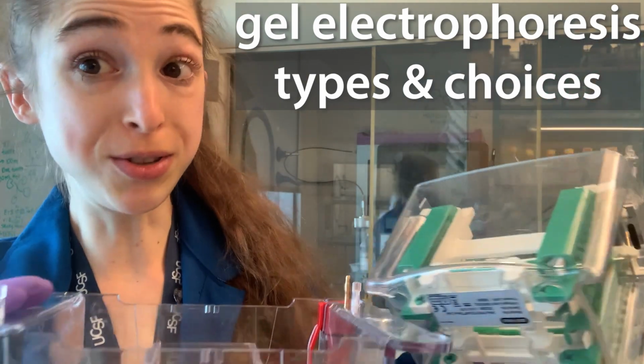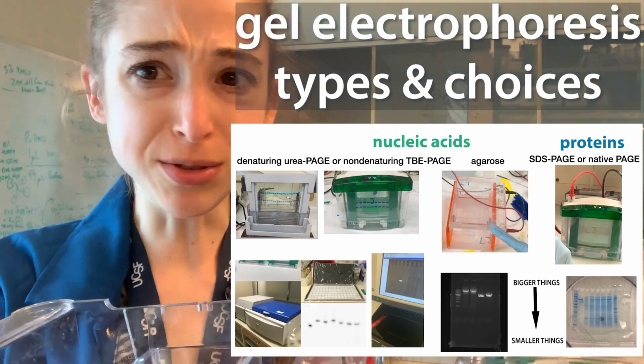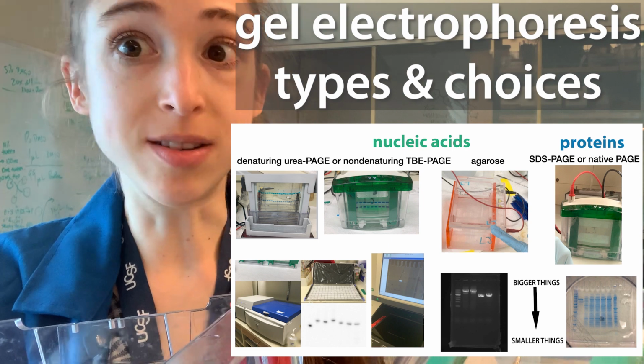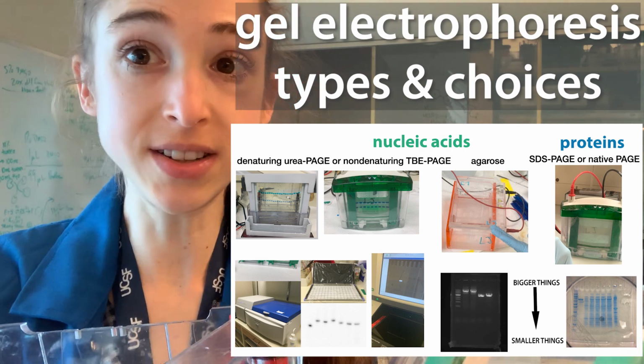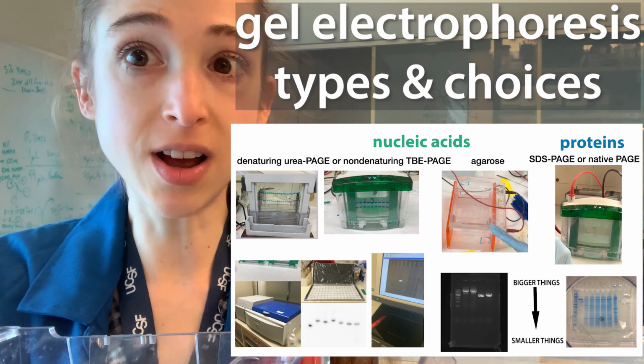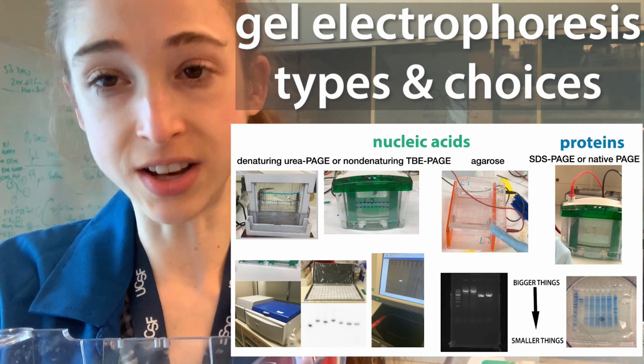What type of gel will suit your experiment well? How do you choose which type of gel to use? Let's talk about things like agarose versus polyacrylamide, denaturing, non-denaturing, what percentage of gel, what buffer, all those various options that you have when you're doing gel electrophoresis.